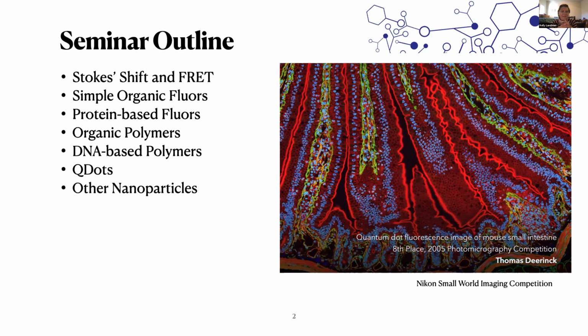And then QDots, which I'm sure a lot of you have already used in imaging, but both Jason and I have supported QDots extensively over the last 20 years. And I always said exactly the same thing, which is that they were not a finished technology, that they were almost absolutely a bandwagon that a lot of people jumped onto, but it was because there was such a pressing need to expand the palette of fluors. And so people would put up with a more cumbersome technology. And that's exploding, like with carbon dots, P dots, all sorts of dots of different matrices in order to control the size and the spectra of each of the dots. So I'll just touch on those at the very end of the talk.